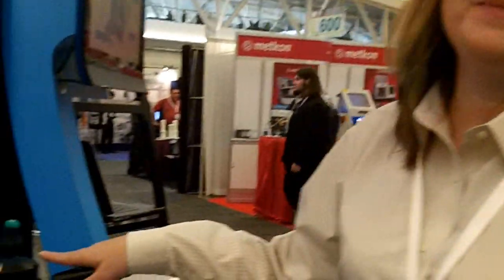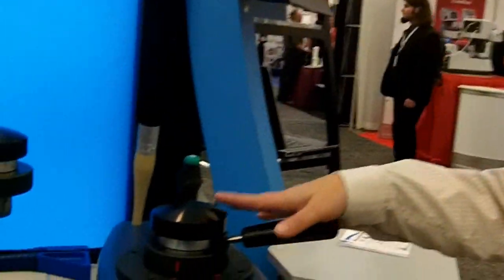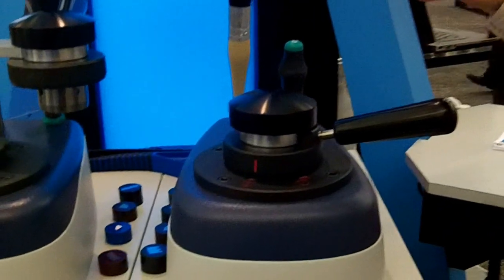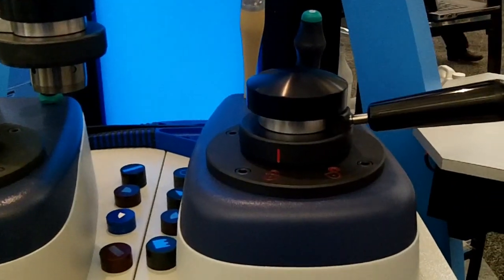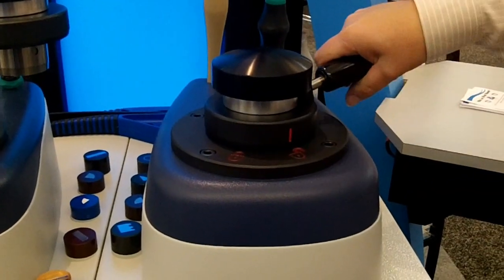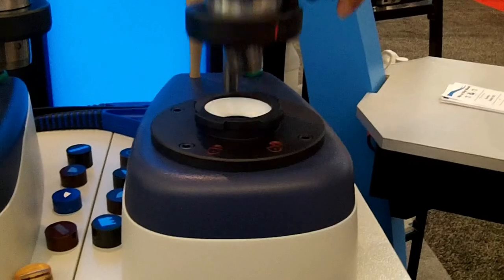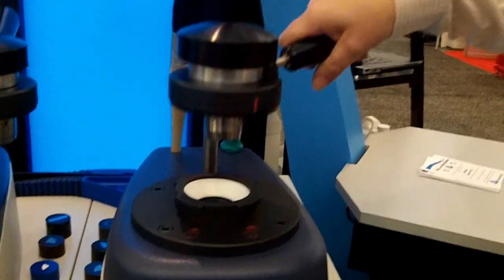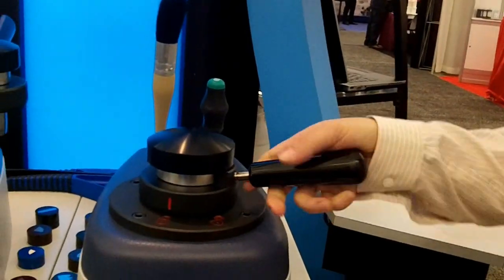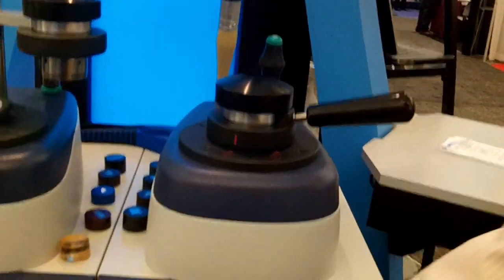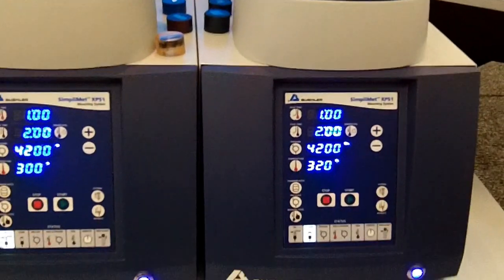So this is a SimpliMet XPS-1, an automatic compression mounting system. One of its great new features is it's easy to open and close with just one hand. Very easy. It has a nice slim footprint.